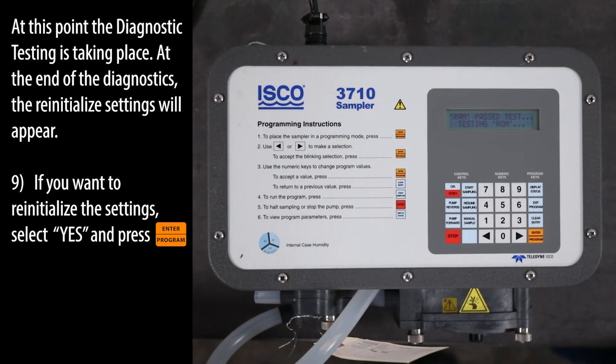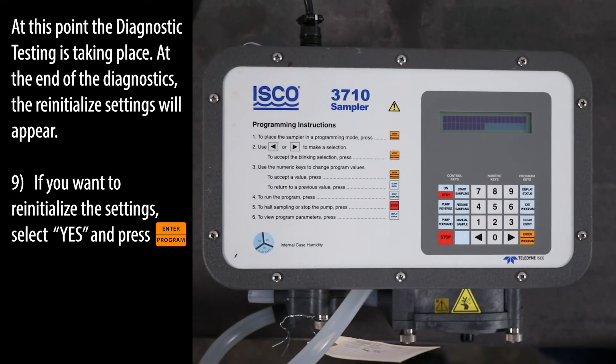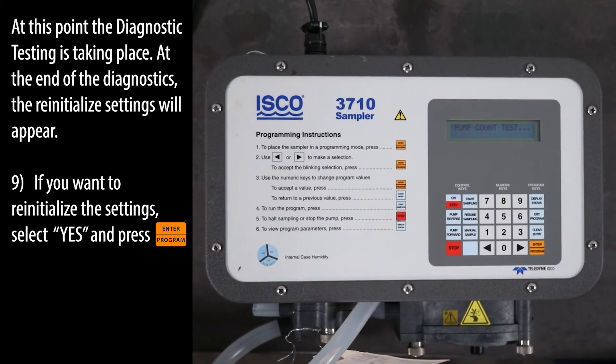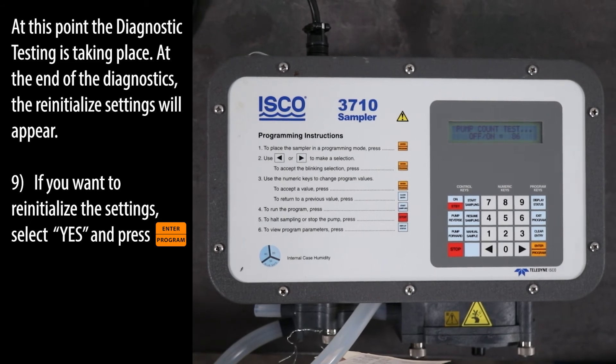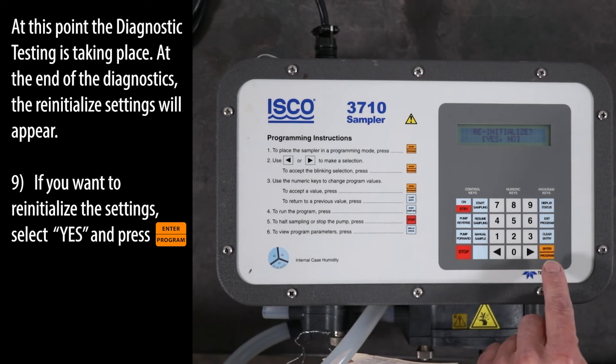At this point, the diagnostic testing is taking place. At the end of the diagnostics, the re-initialize settings will appear. If you want to re-initialize the settings, select YES and press the ENTER program key.